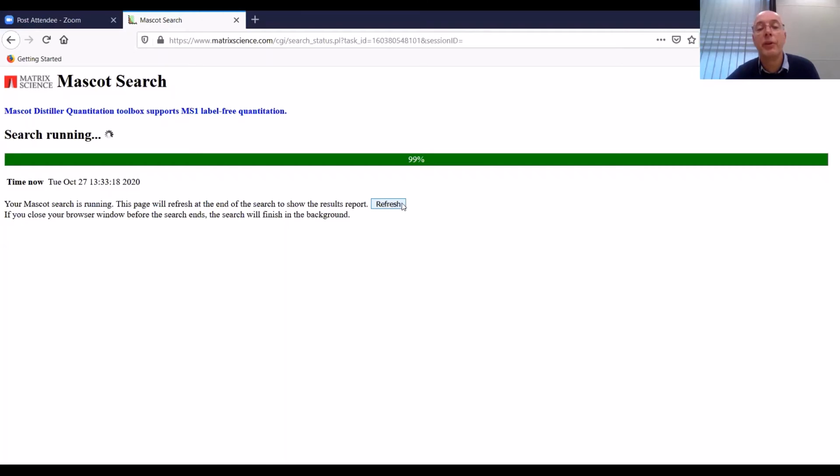It doesn't seem to want to show us anything. Would anybody else like to share their screen? Mine seems to have not been doing very much. Okay, no response to that. Let me try and refresh this. I'm getting an error message saying the server's busy. Ah, yes, probably it's because somebody's running a training seminar. I thought that might be it.